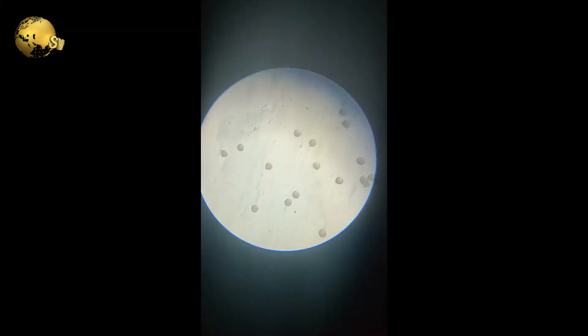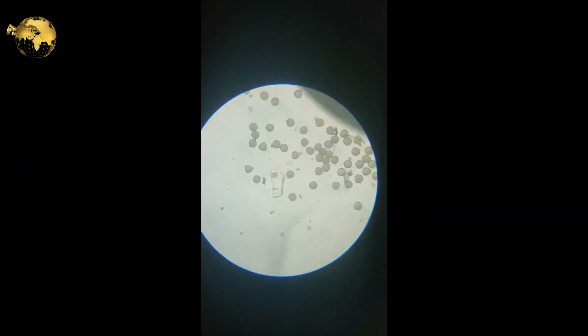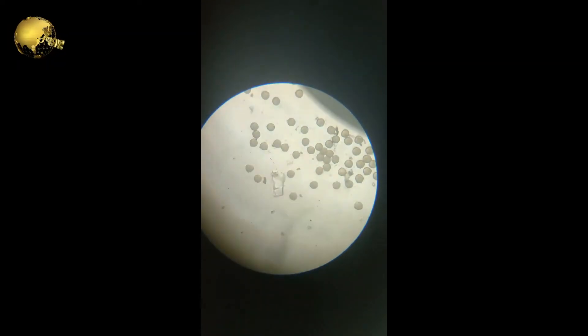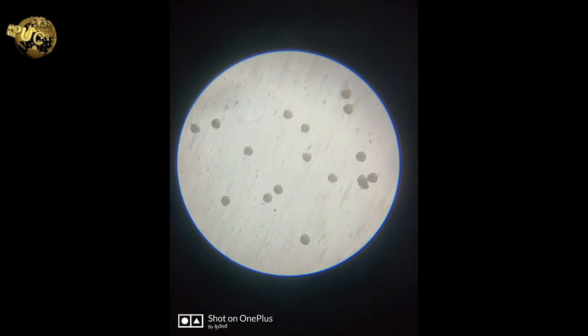In the first trial, number of pollen grains on a microscopic field was 16, and the number of pollen grains germinated is 5. In the second trial, the number of pollen grains on the microscopic field is 53, and the number of pollen grains germinated is hardly 4. In the third trial, the number of pollen grains on the microscopic field is 14, and the number of pollen grains germinated is 4.